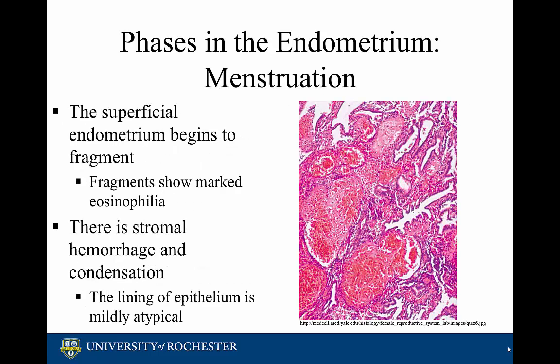During menstruation, the superficial endometrium begins to fragment and there is stromal hemorrhaging and condensation. The endometrial fragments show marked eosinophilia and the lining of the epithelium is mildly atypical.